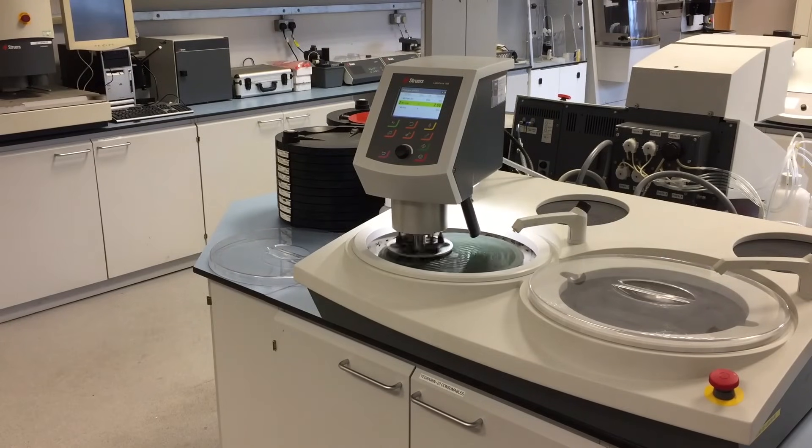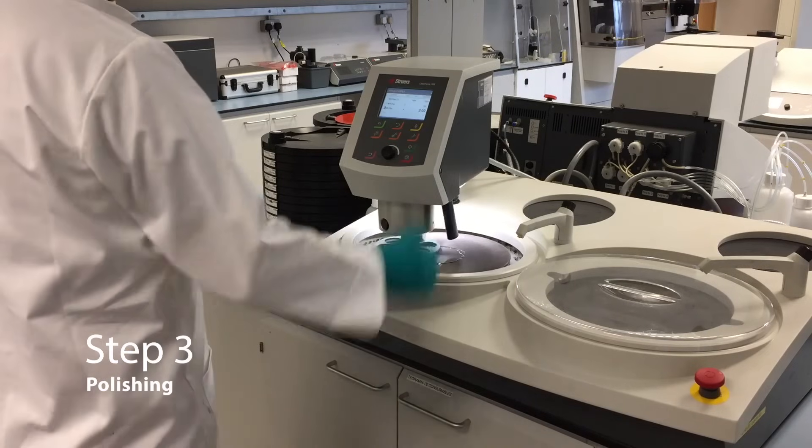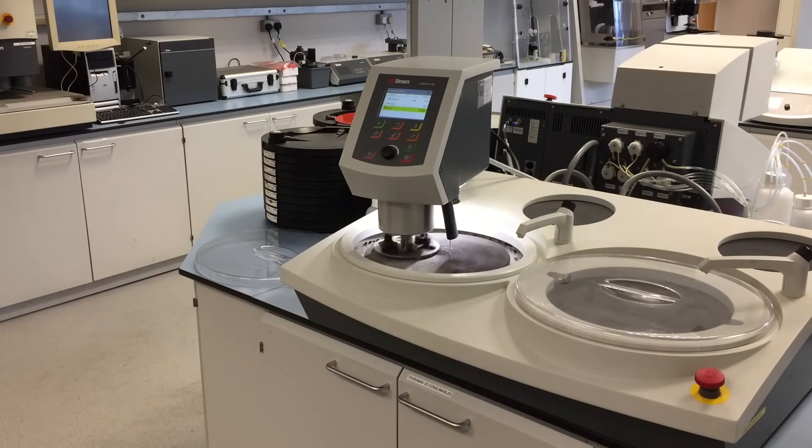Using the LAVO DOSA 100 means you have automatic dosing of diamond suspension and/or lubricants. The final diamond polishing stage. The LAVO system has an inbuilt soft start for less wear and longer lifetime of consumables. Did you know that switching from a 250mm diameter disc to a 300mm diameter disc gives you an increase of 44% in area? Meaning faster processing time, more room to polish larger samples and an extended consumable lifetime.